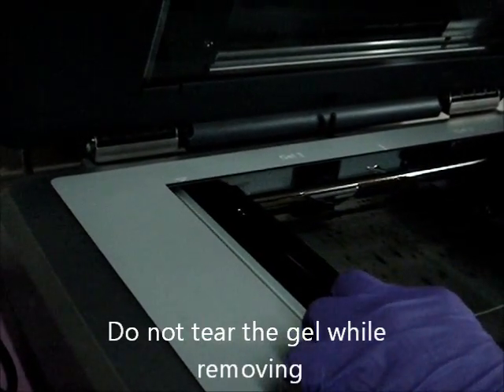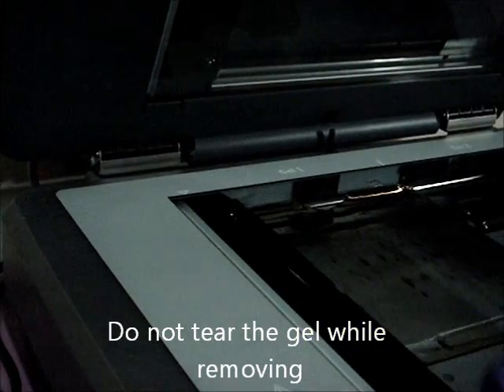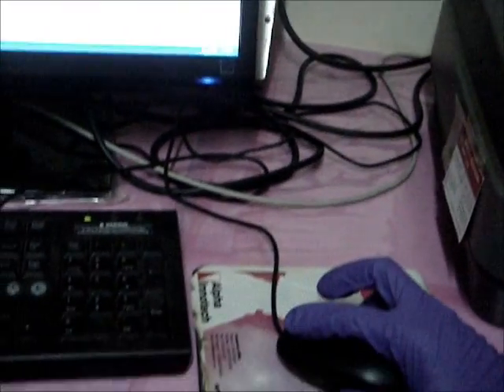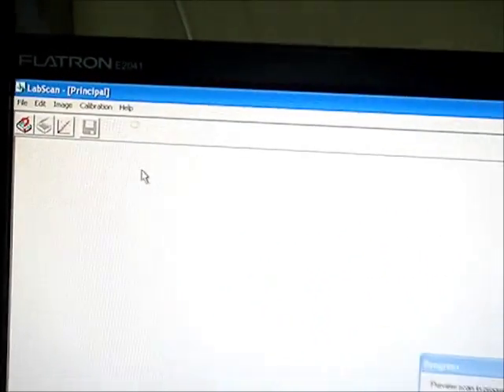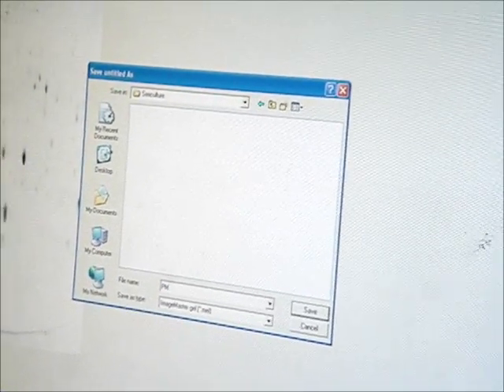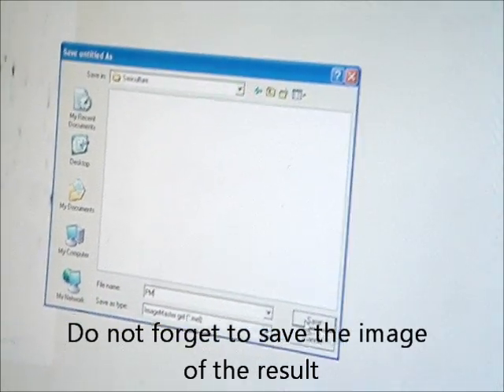Step 6: Scanning the gel. Remove the gel from the staining solution and place it over the scanner. Cover the lid of the scanner and get the image of the gel using the lab scan software. Do the necessary manipulations using the software. Save the image of the result in the required folder. Finally, get the printout of the image and compare the results.